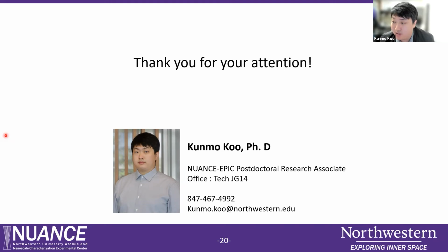But in my opinion, it is not very high, somewhere around atmospheric pressure, because some pressure-related reactions like nucleation are not very different from the outside experiment. And the temperature is not really high, because if the temperature in the GLC were very high, you could not see the liquid inside because it would evaporate really quickly. Graphene is a very good conductor of heat, so the heat will dissipate really quickly. So I think the temperature is around room temperature, but we can still use a heating holder or cryo holder to control the temperature a little more precisely.